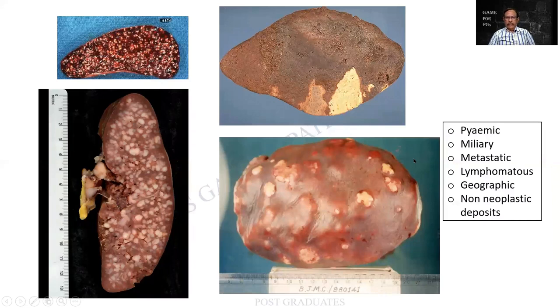An infarct, is it clear? An infarct can be an area of localized necrosis caused by the sudden, complete and irreversible occlusion to the vascular flow. And this is what I had mentioned earlier. Whenever we see multiple nodules, this is fairly regular, so it need not be an infarct. But if it is going to be irregular like this, I will have to think of multiple abscesses or infarcts. Multiple infarcts can be happening in conditions such as a sickle cell anemia, where there can be repeated obstruction.